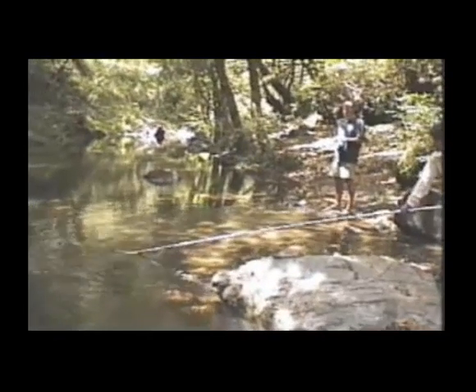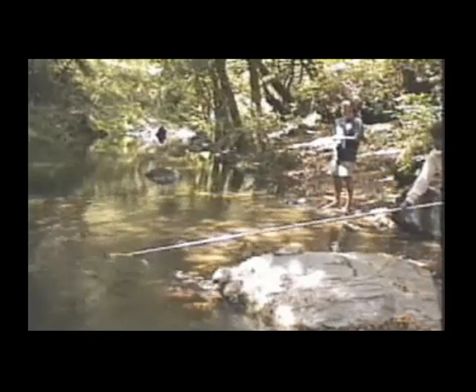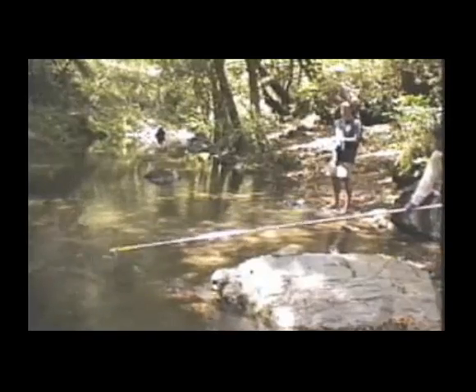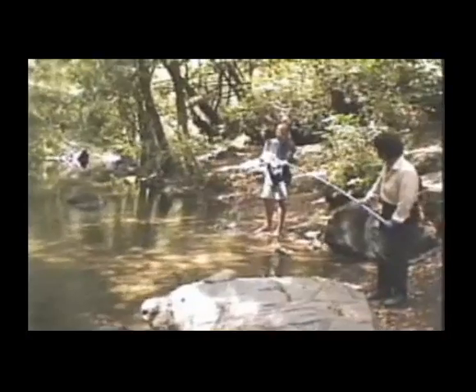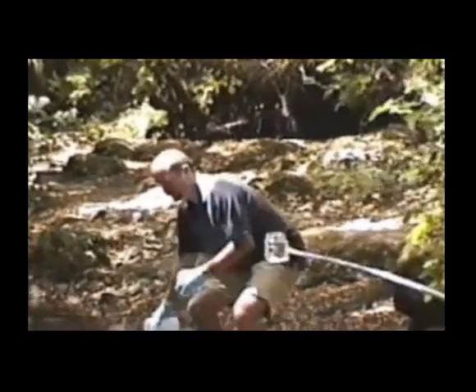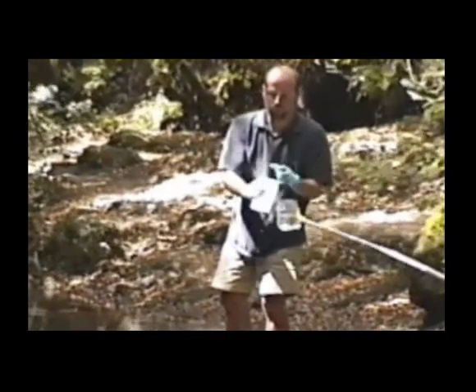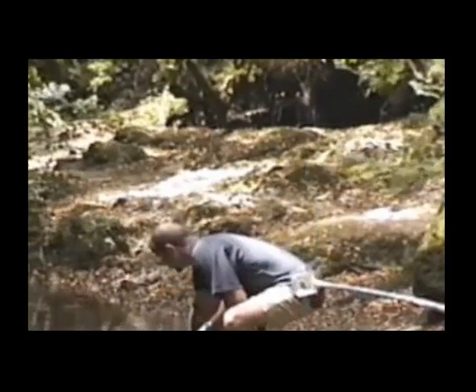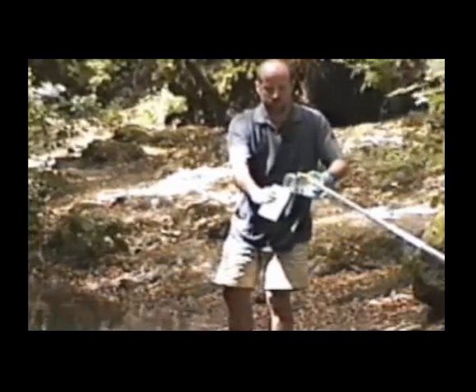She rinses the sample container 3 times with the ambient water and then collects a sample and conveys it over to the person that has the actual sample container. He will then rinse the sample container 3 times in a similar fashion, disposing of the rinsate water downstream and behind. And this is the 3rd rinse.